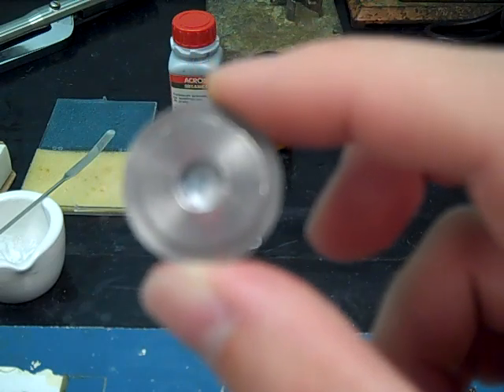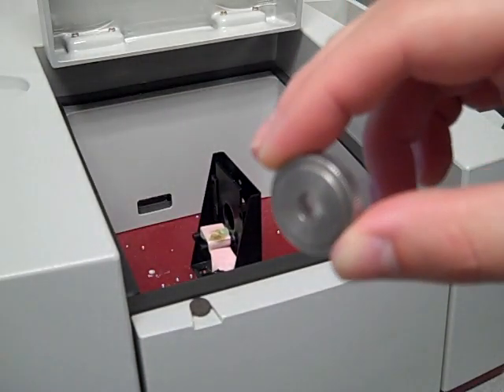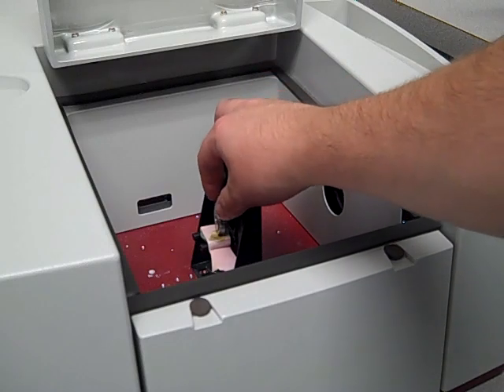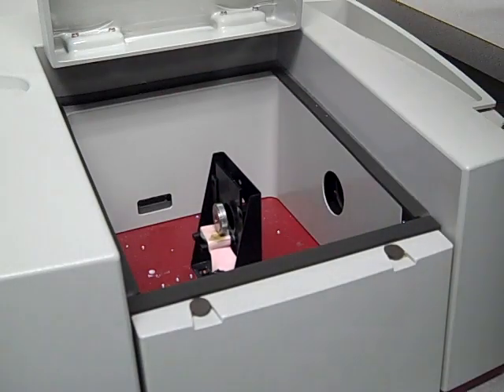So next we need to run this in the actual IR instrument. If you're more curious about how to actually run the IR instrument, you may want to check out the video on infrared spectroscopy. But for this, I'm just going to show you how to load. Once you've done the background run on your IR, you're going to open up this top latch, and then, being really careful not to break your IR pellet, you're going to slide that down and set it right on the two pegs that hold the sample in place. Once you've gotten that in place and it's as straight as you can get it on those two pegs, then you'll be ready to close up the instrument and do the sample run.